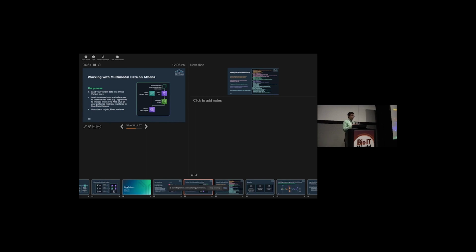There's a number of different ways that you can do that, because Athena has a lot of hooks into a lot of different other sources of data. But the most straightforward one to describe, and the one that we used for this client, was to use Glue ETL to convert CSV data into Parquet and put it in S3 buckets that the client controlled, and then to use that Lake Formation thing that you demonstrated to bring the Omics variant table into the same Athena workspace and Athena database as the other modality data.